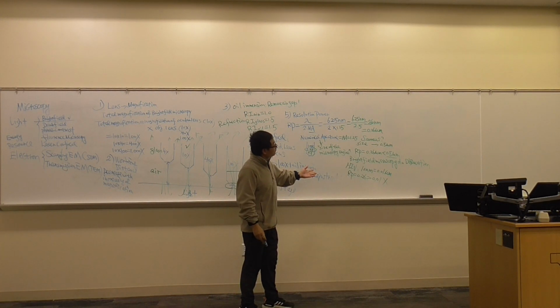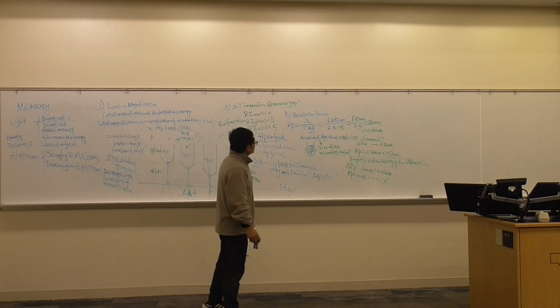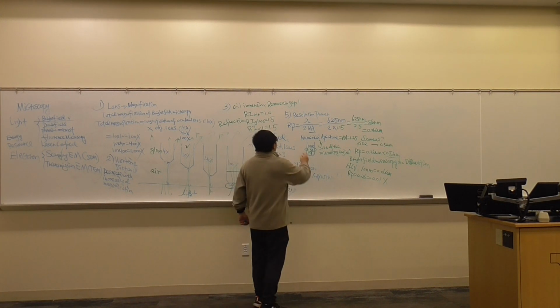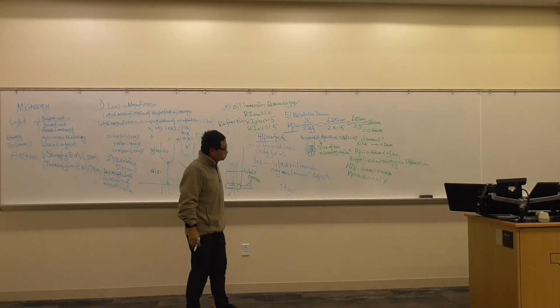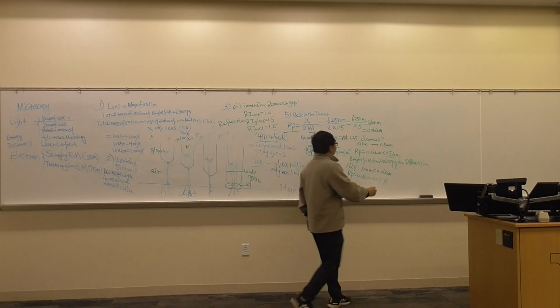So this is where the formula tells you the resolution power, what it is, and how we do the calculation. And from here you could see, we want this resolution power value, the smaller the better.